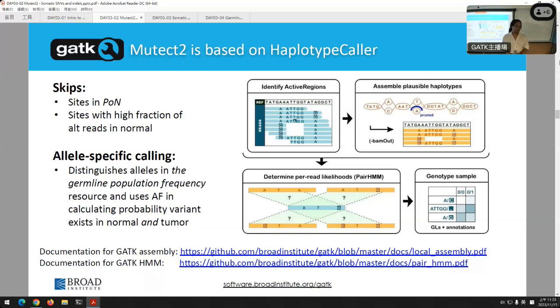Okay, so the question was, when I mentioned HaplotypeCaller behind the scenes, we use it based upon a certain assumption of what that genome might look like, and does that cause issues when dealing with cancer cells here? We make other tweaks to HaplotypeCaller. There are a series of tweaks. One is, of course, I mentioned we have different thresholds that we apply to germline. We also change the part where we compute our likelihoods and call variants based on that.